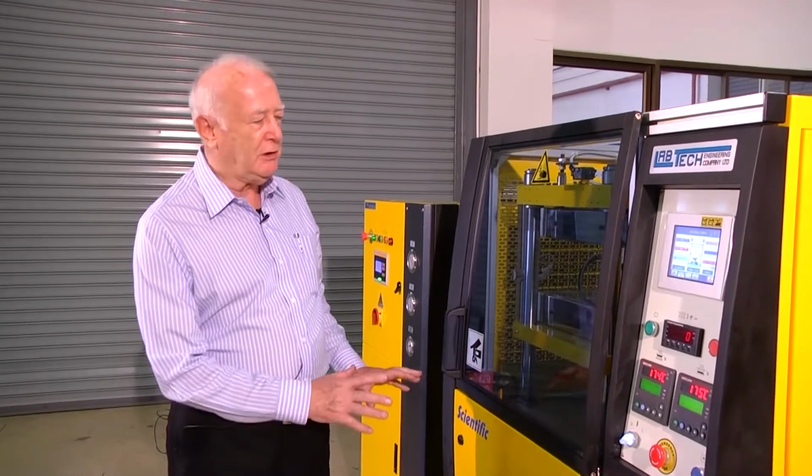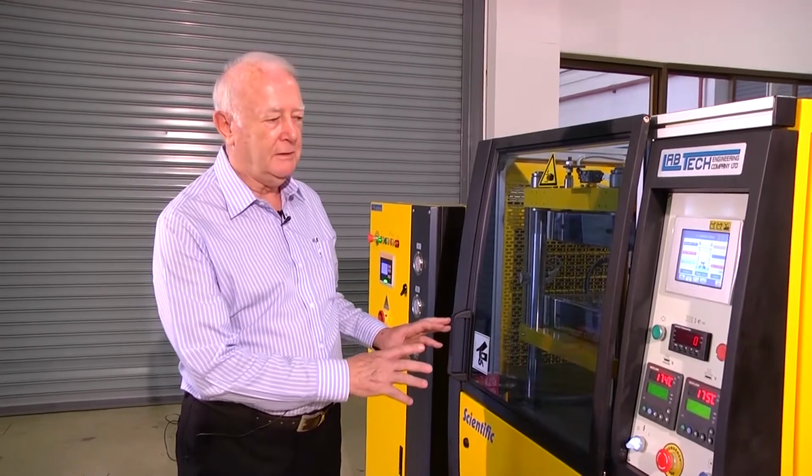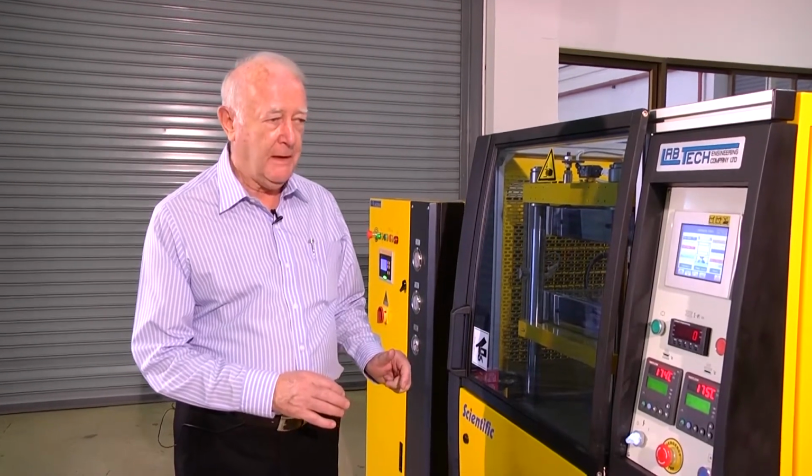But before actually describing the ASTM cooling layout, why do we need ASTM cooling anyway? Well, the reason is because with normal, traditional cooling of a normal press, we use mains cooling water, and the cooling rate from the hot pressing is very rapid initially.